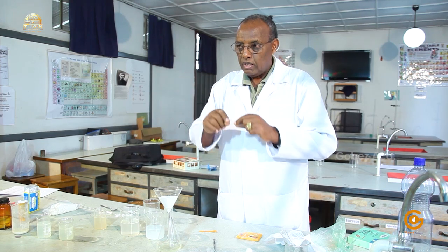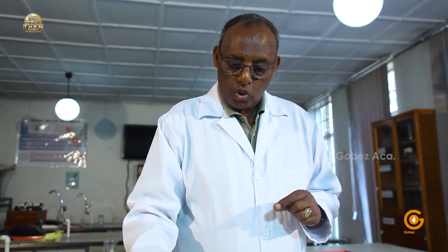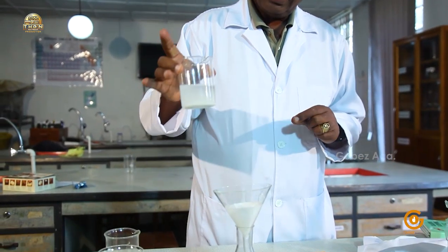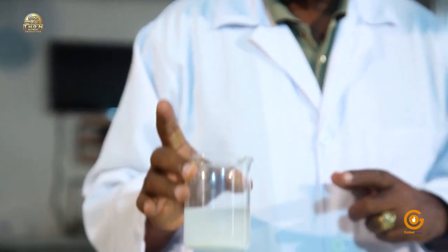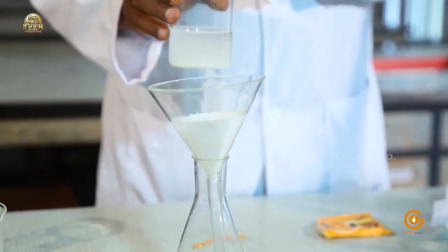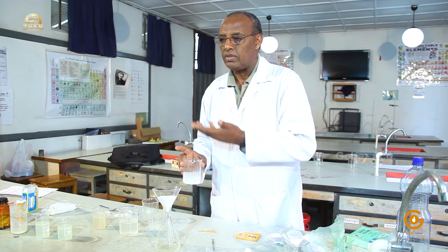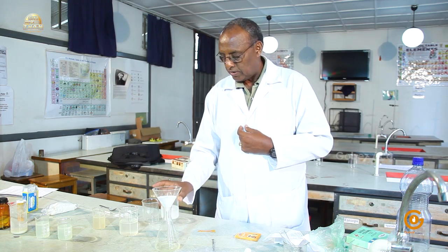When mixed, they made a white precipitate. That is not a simple physical process, it's a chemical reaction. When we dissolved sodium bicarbonate in water, it was different from the others. It produced gas. The gas was carbon dioxide.